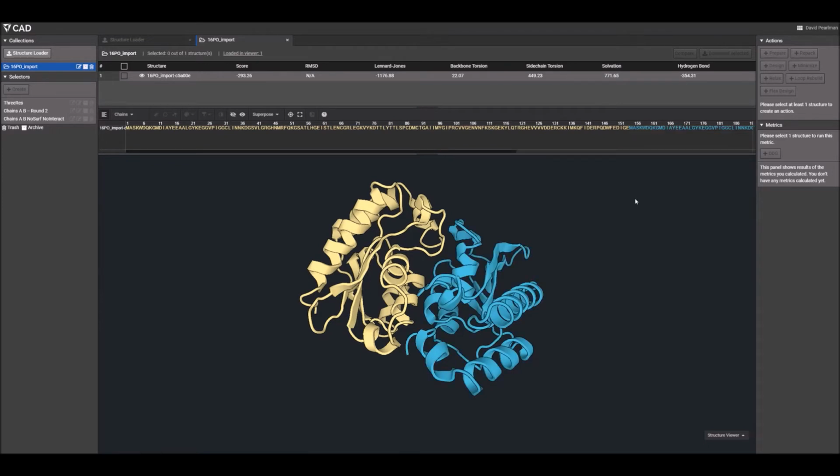This will become important if you're trying to follow the literature where the protein numbering follows the standard numbering rather than this concatenated numbering. So you will have to figure out that correspondence. I've already done that for the demo I'm going to show you.